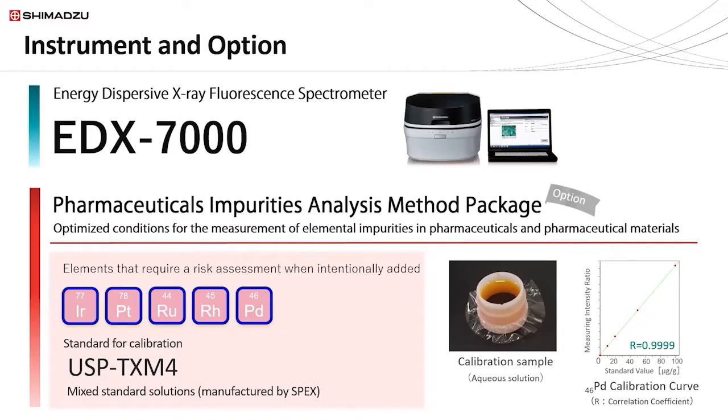Without getting too much into the science of this software package, there are certain correction factors that are used. For example, overlap corrections, what's called a ratio method, and a Compton background correction, that are used to better improve the quality of the data.